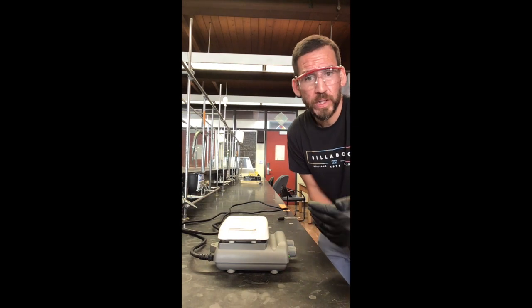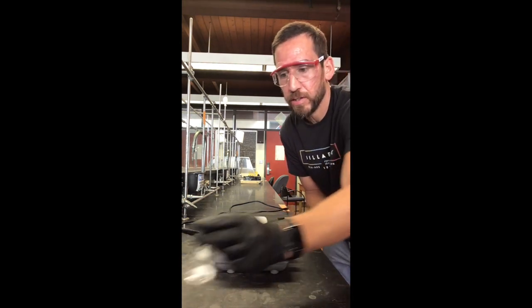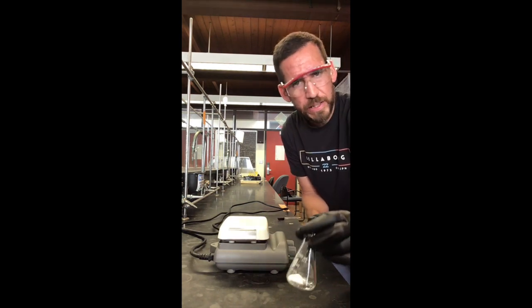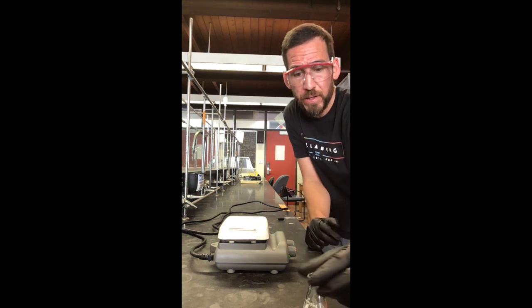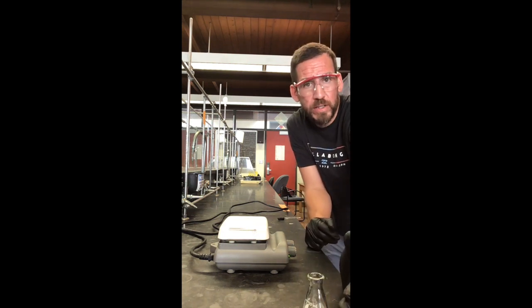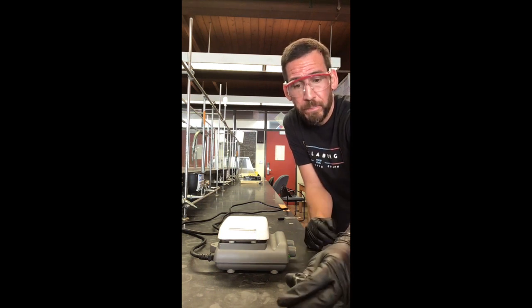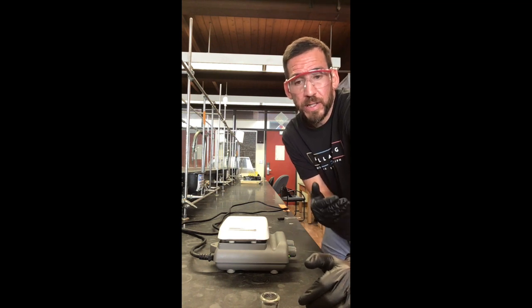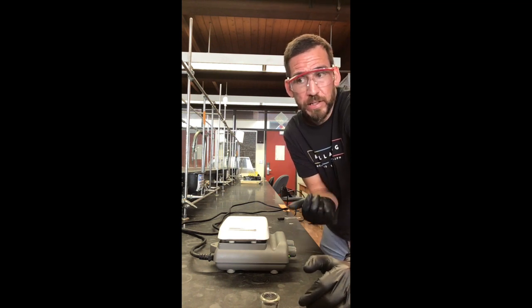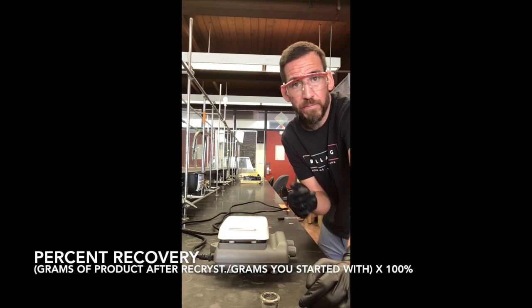All right, so what we're going to do now is the crystallization of this particular substance. You don't really need to know what it is because we're only talking about the procedure and the method or the techniques for crystallizing. But it is caffeine, and just for the sake of calculations at the end, I want you to determine the percent recovery. So we have 508 milligrams right now, so 0.508 grams.